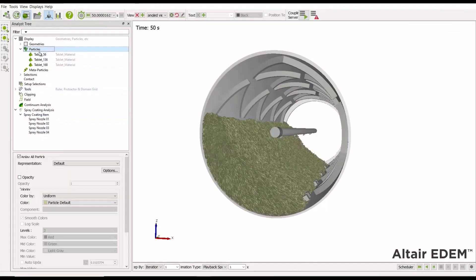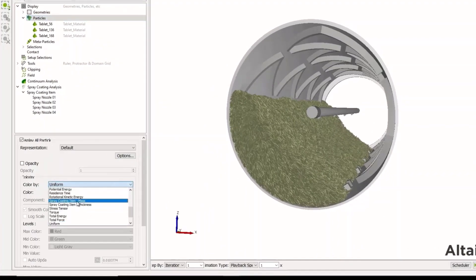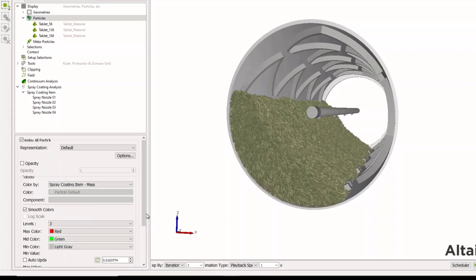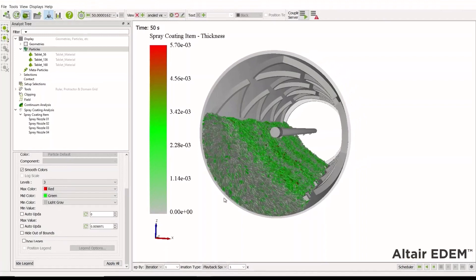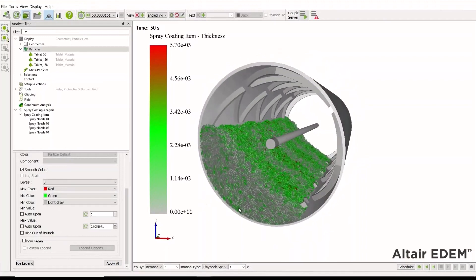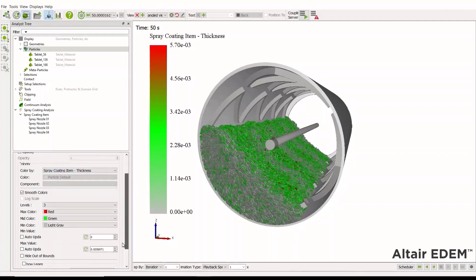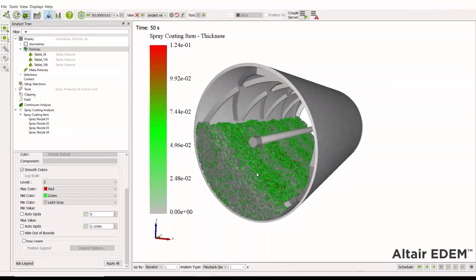Going back to the analyst and to our particles, we can display the coating on the particles. There are new parameters written to the model: coating mass and coating thickness. Choosing auto-update for minimum and maximum values, we can see the different spray areas, the influence of them, and the mass of the coating in those areas. Displaying the thickness shows a very similar distribution as well.